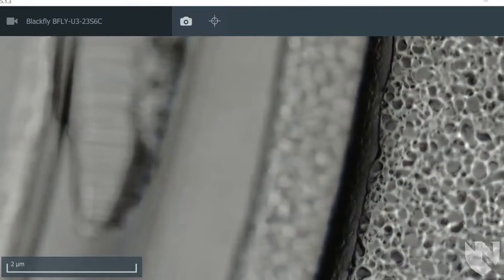To get your slide in focus, it is a good idea to find a squamous epithelial cell and make sure that is in focus. Another option would be to find the edge of the well you are using and get that into focus.